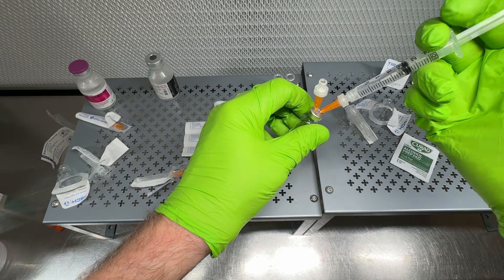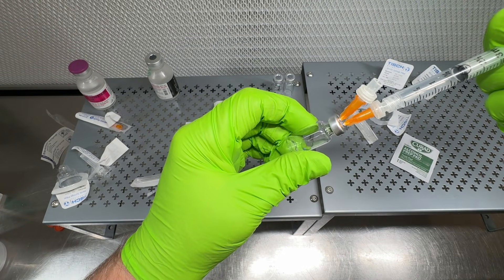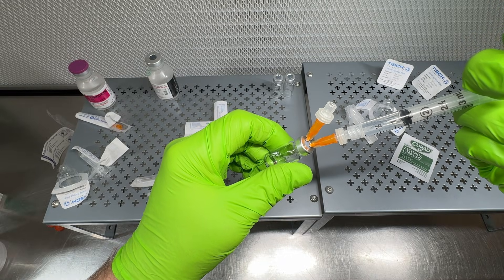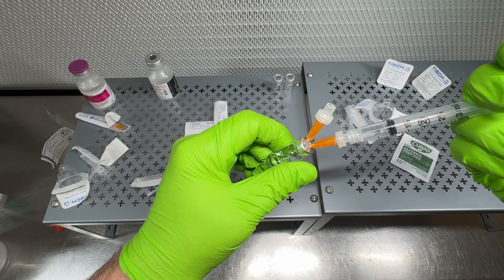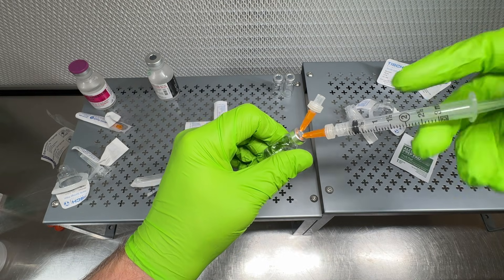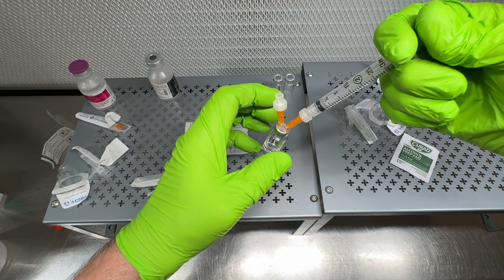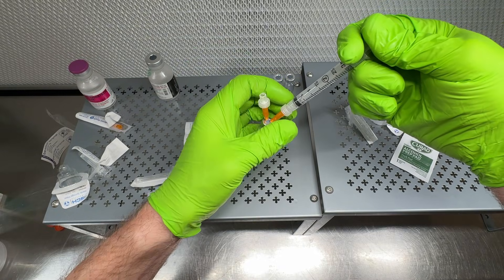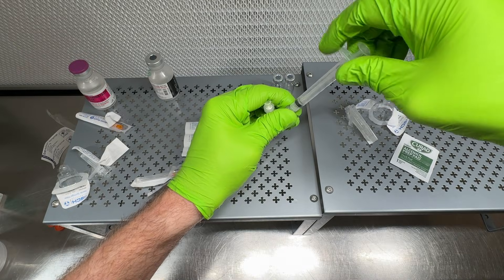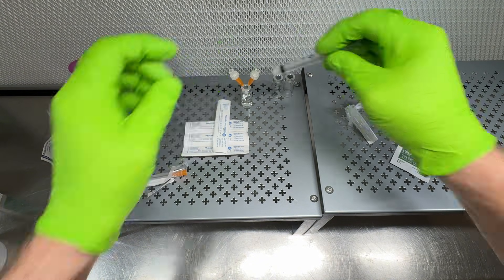Puncture the vial's injection port and filter all of the solution through — about two milliliters. It's easy to push through, and since the vial is vented, all the extra air and pressure goes out the vent needle on the side. You can see the solution going in. You could probably easily filter up to five milliliters through a 4mm filter like this.